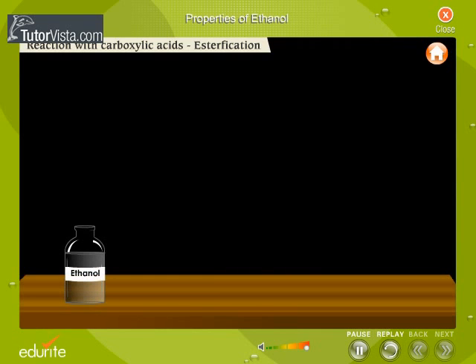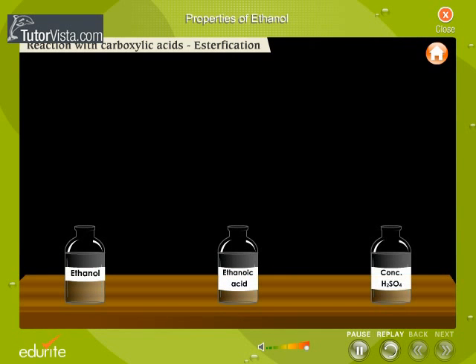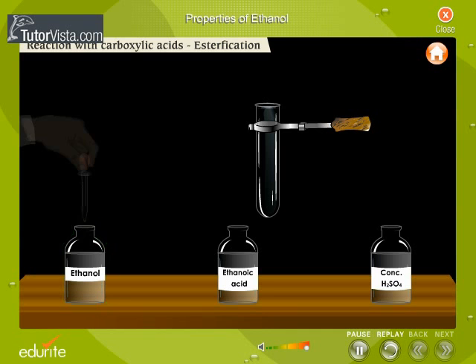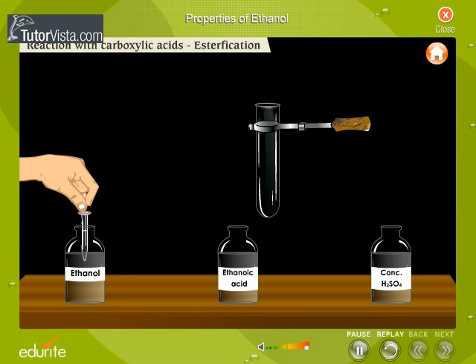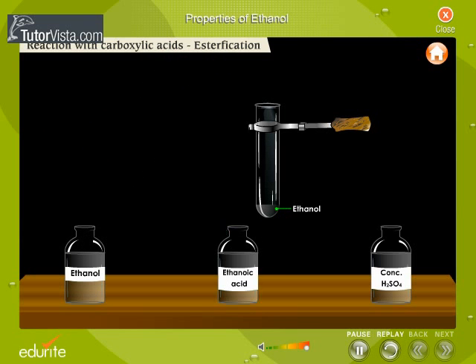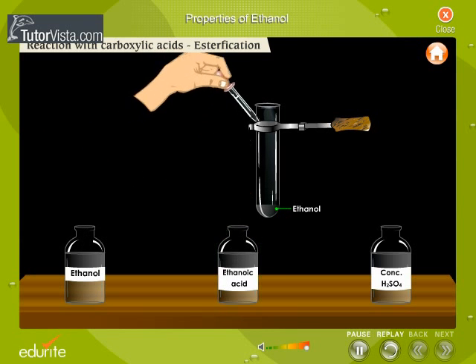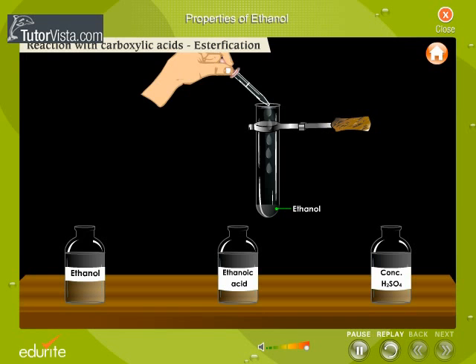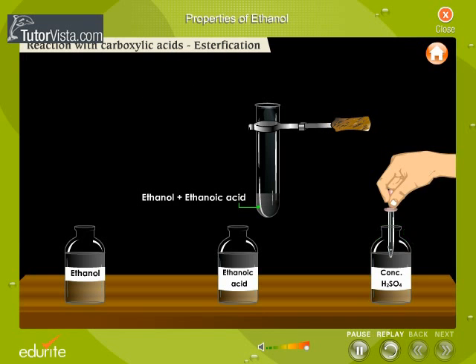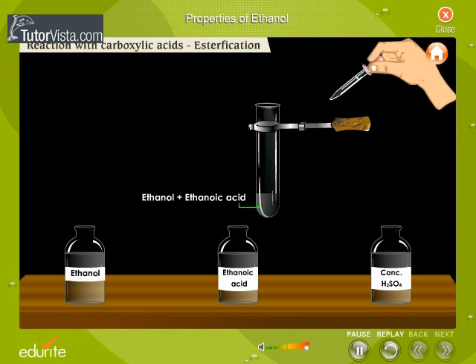Reaction with carboxylic acids — Esterification. Let us observe how alcohols react with carboxylic acids. Ethanol is taken in a test tube and a small amount of ethanoic acid, a carboxylic acid, is added.